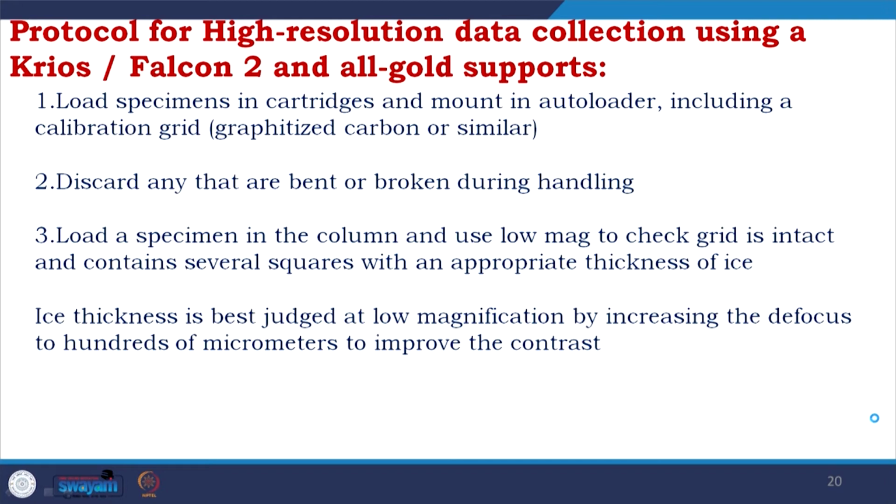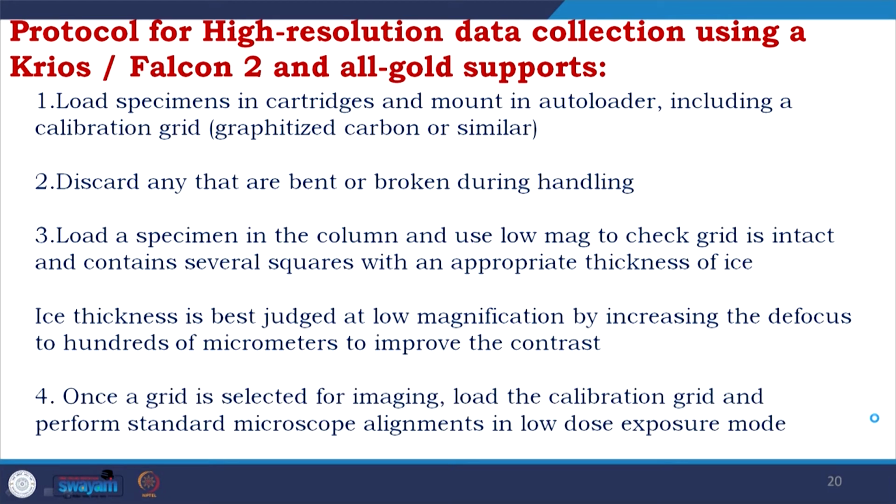So, again the vitrification, ice thickness is best judged at low magnification by increasing the defocus to hundreds of micrometers to improve the contrast. Once a grid is selected for imaging, load the calibration grid and perform standard microscope alignment in low dose exposure mode.